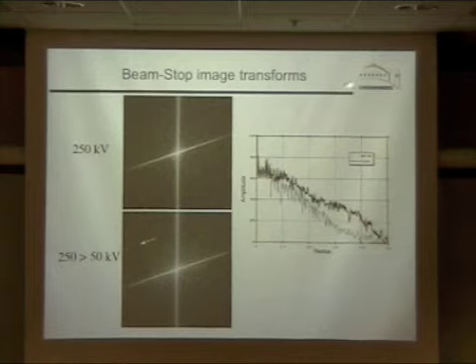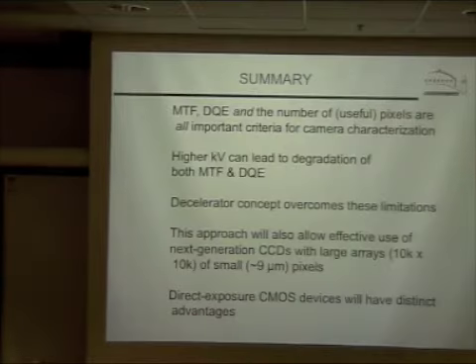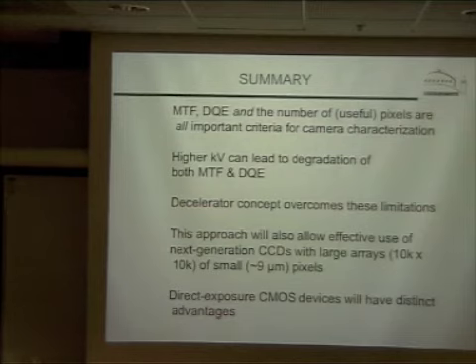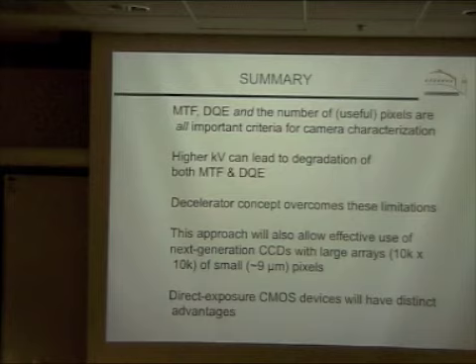And you sort of get a sense of that from line plots of the amplitudes along. So the different KVs where you had sort of one main signal peak and then another one which was a scattering event, wasn't it? There was more scattered events as you went up in KV. So my question was really with regards to that graphic, in lens coupled systems or with the decelerating system, do you actually eliminate the scattering events or do you just stop the backscatter?